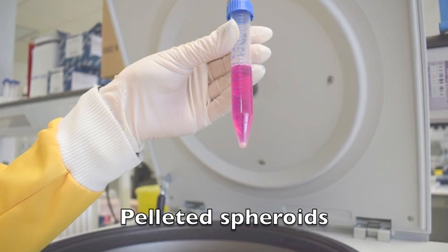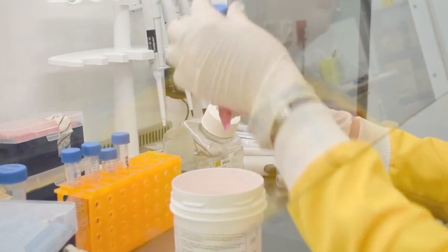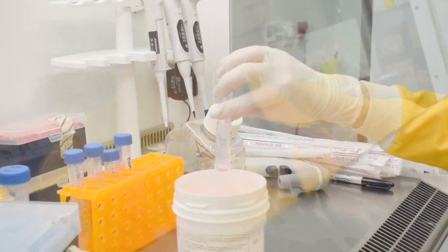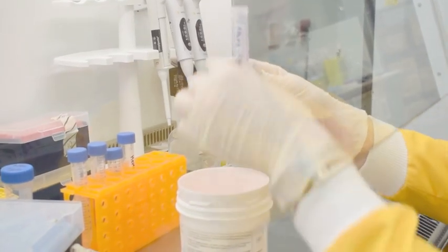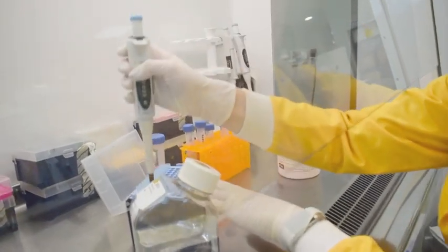Following centrifugation, a pellet of spheroids should be visible. The supernatant is then discarded. The pellet of spheroids is then resuspended in PBS.